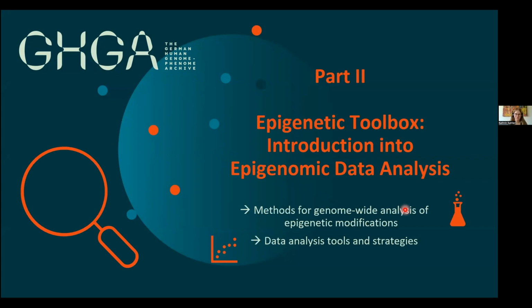So then, we start with part 2, our epigenetic toolbox, the introduction into epigenomic data analysis. Actually, we will not talk so much about the data analysis part because I think this is a bit beyond the scope of this webinar. But I will rather focus on the methods that we perform in the lab for the genome-wide analysis of the epigenetic modifications, but I will also show what we can expect as output. And in the end, I will also do a short highlight of some data analysis tools and strategies.